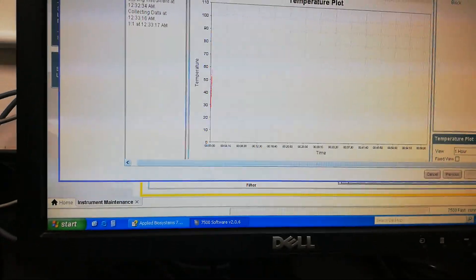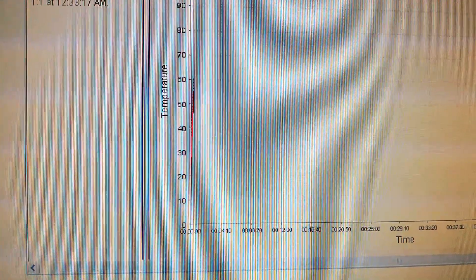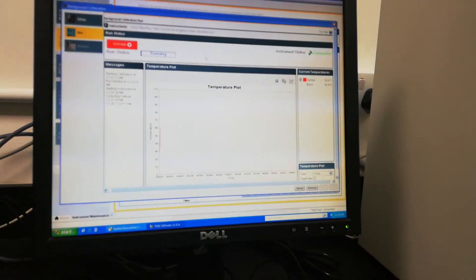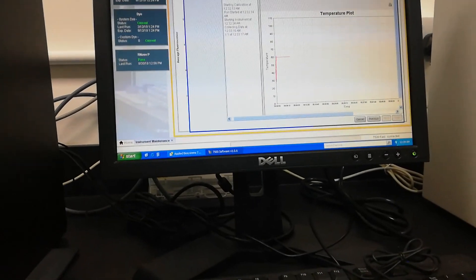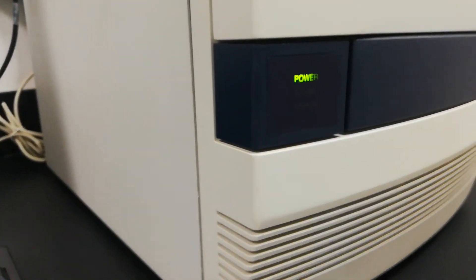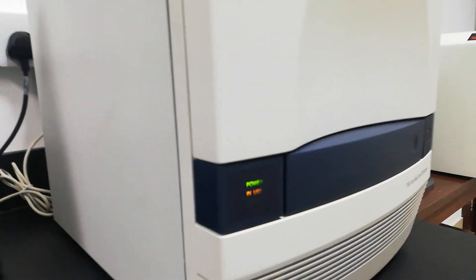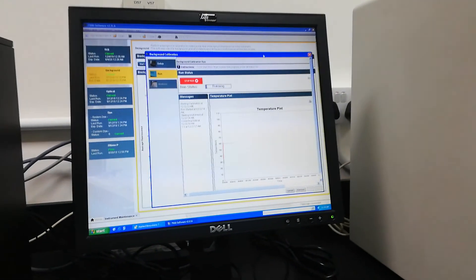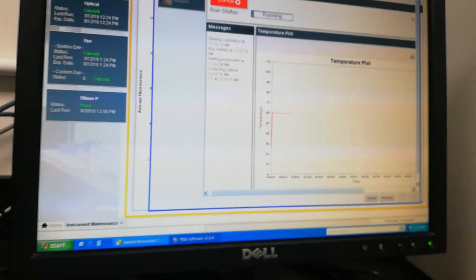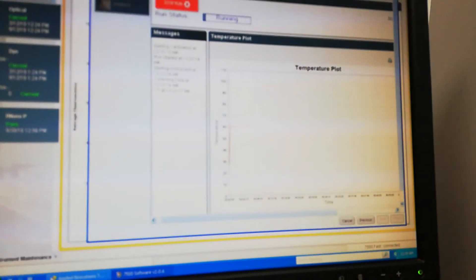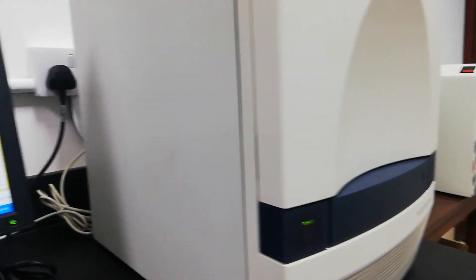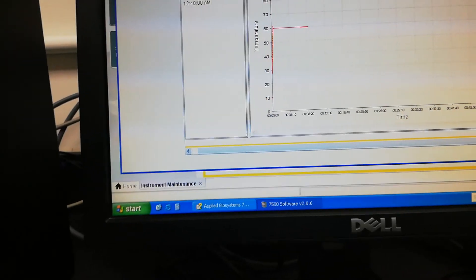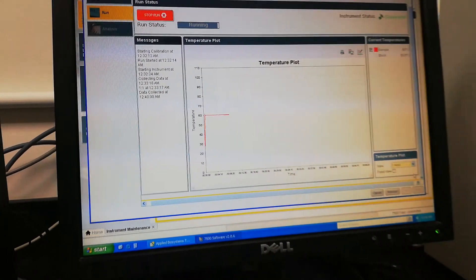Now you can see it will show the calibration is happening, the background calibration.